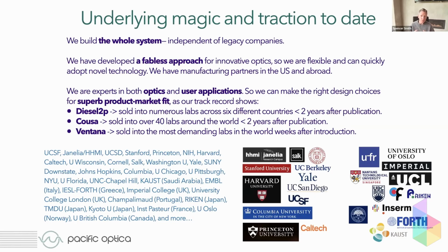And since we know the optics, we know the user applications, originally I was just open sourcing all this stuff, but it turns out that very few labs have the expertise to actually do precision alignment of custom lenses in their lab to build a custom objective. And so I worked as a consultant for a little while to coordinate manufacturing runs. We just realized that there's actually a lot to do, and there's a lot of potential impact we could have. And we've been really pleased at the results so far.